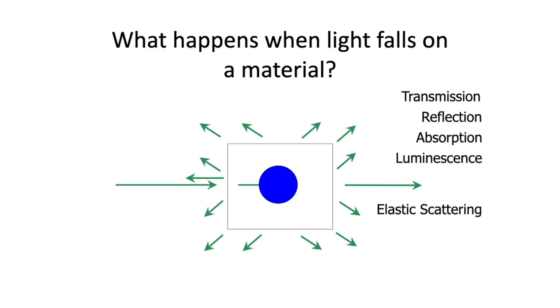Now, another interesting thing that happens is inelastic scattering. Again, like a collision, when I said elastic scattering, there is no change in energy. Here, now the change in energy happens, and that means the color changes. So you can have a blue shifted light or red shifted light. This blue shifted, red shifted light is actually the Raman scatter. And that's the interesting aspect.